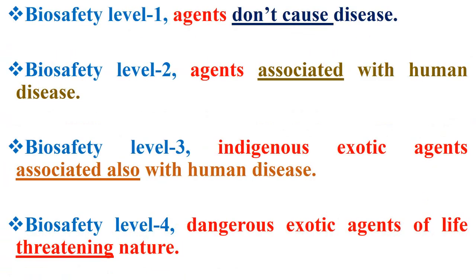In general, biosafety level 1 refers to agents that don't cause disease, and biosafety level 2 refers to agents that are associated with human disease. Meanwhile, biosafety level 3 refers to indigenous and exotic agents also associated with human disease, and finally biosafety level 4 refers to dangerous exotic agents of a life-threatening nature.